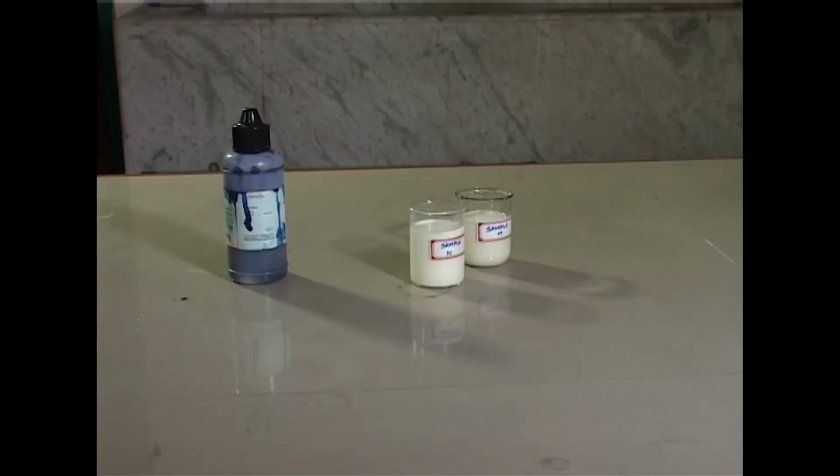So, we first need a methylene blue dye solution. Concentration is 1 milligram in 50 ml of water. Apart from this, for performing this test, we have taken 3 different milk samples, abbreviated as M, N, P. M stands for 2 weeks old milk sample, N stands for 2 days old milk sample, P stands for fresh milk.